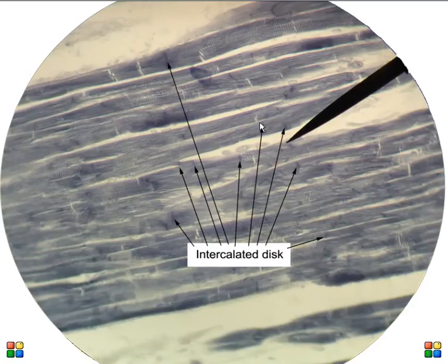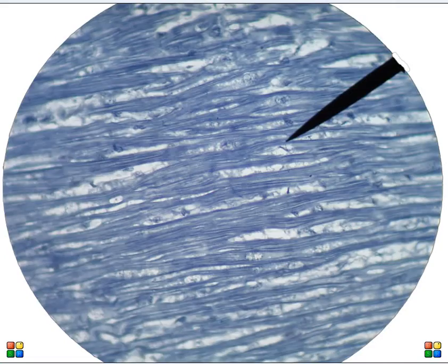There are a lot of arrows here going to various intercalated discs. So again, this is basic cardiac muscle. I'm going to keep clicking because there are other pictures also of cardiac muscle.